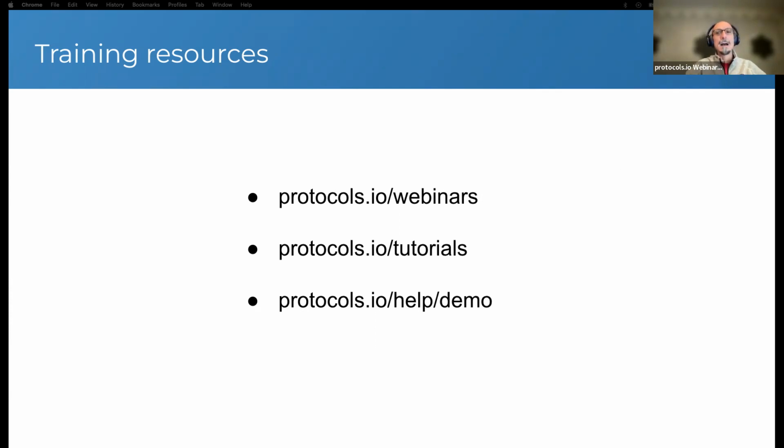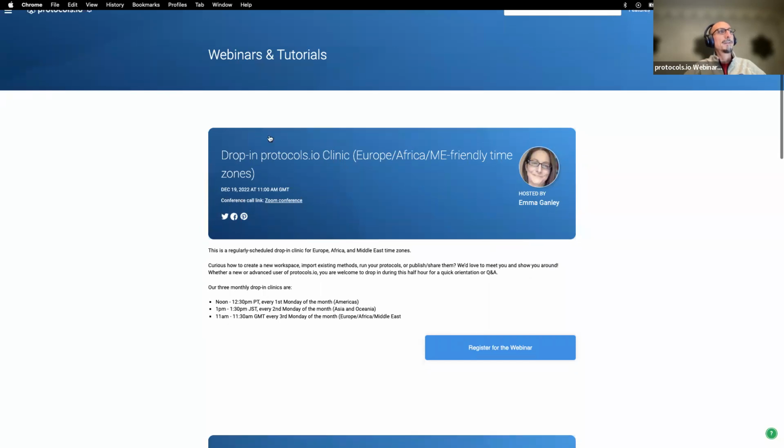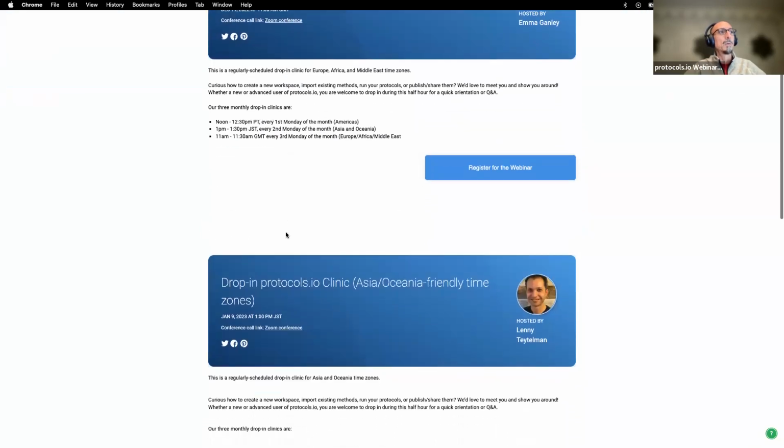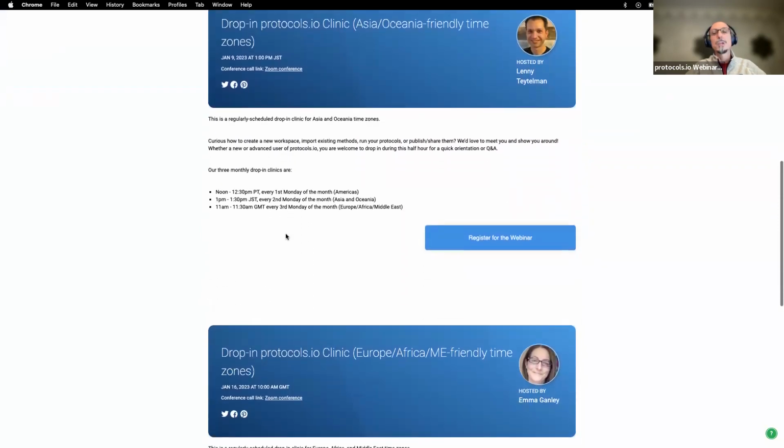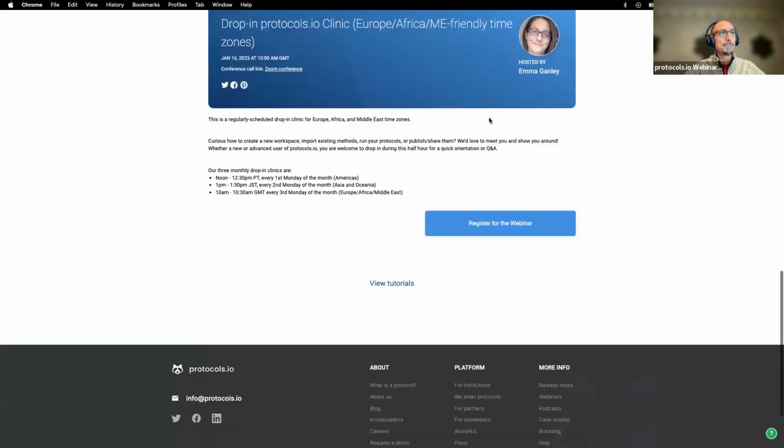We also have what we call drop-in clinics, and I'm going to open our website. So you can see that we also have scheduled drop-in clinics, which are agenda-free, like office hours, where you can just show up with the specific questions that you might have and discuss those questions with one of us.